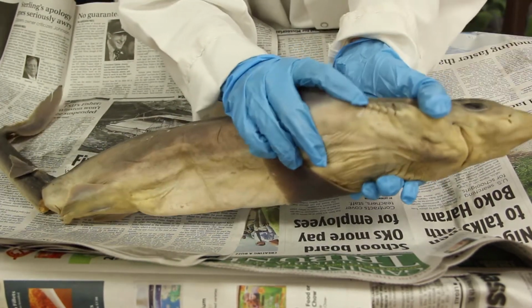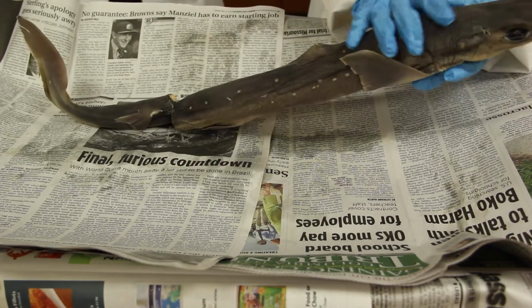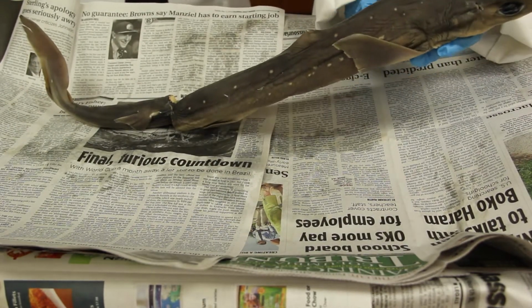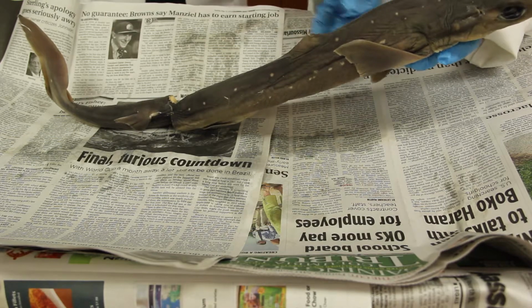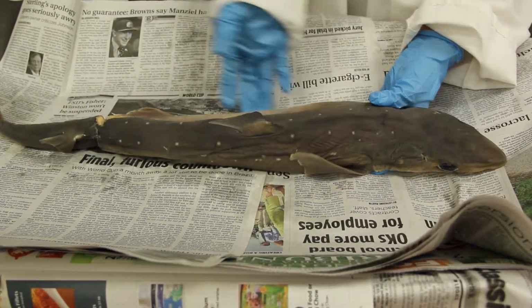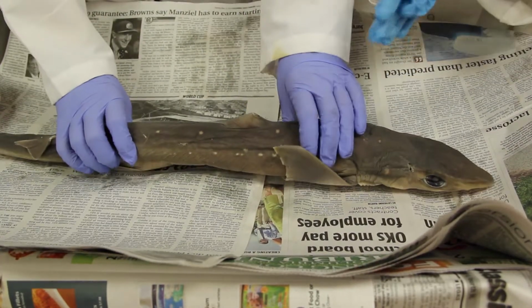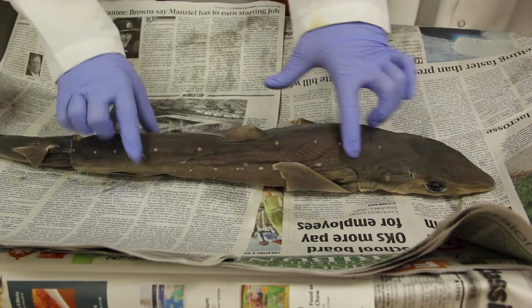You can kind of see them, they're like little holes. And then blood in the gill filaments absorbs oxygen from the water, and the heart pumps blood from the body to the gills for oxygenation. Then from the gills, the oxygenated blood returns to the body.